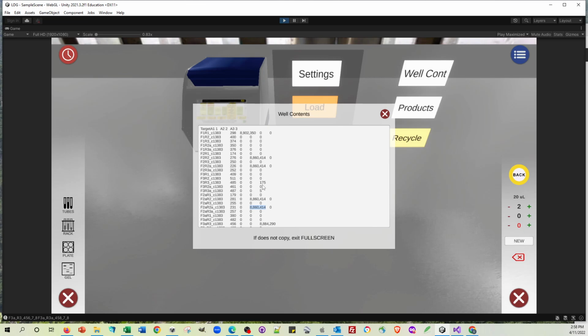There's a couple of other things that have happened underneath the bonnet there. One is that I've introduced a much tighter dependence on the DNA polymerase activity, so that what the student adds to the tube is taken care of. There's a dependence on the level of the dNTPs, which there wasn't before.